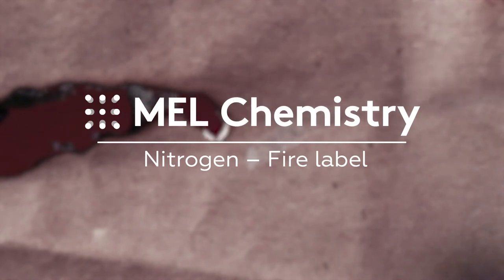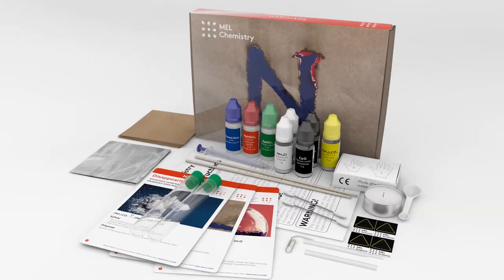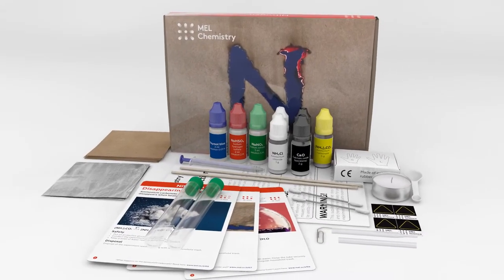Welcome to the wonderful world of chemistry. Today, with the help of the Nitrogen Set by Mel Chemistry, you will learn how to burn a pattern on a piece of paper.